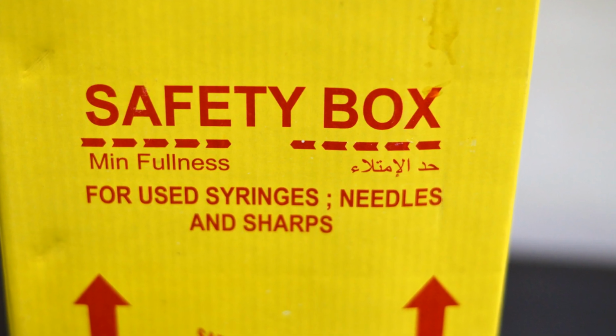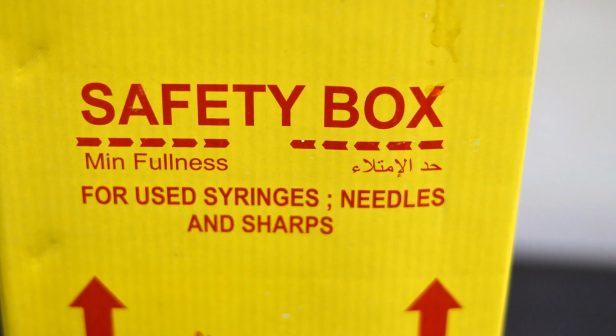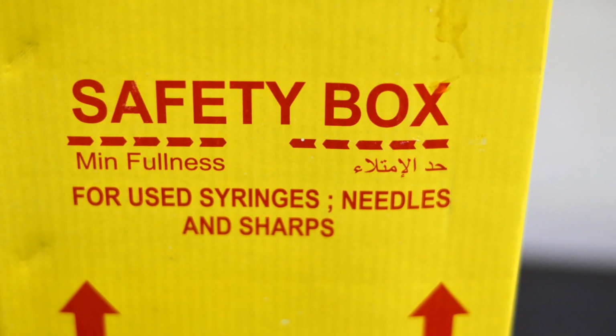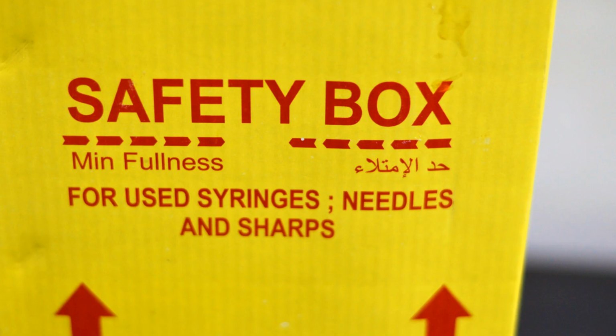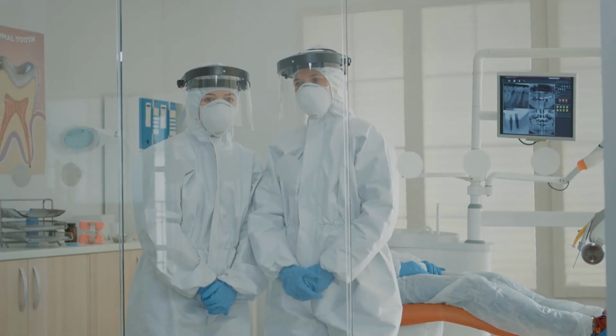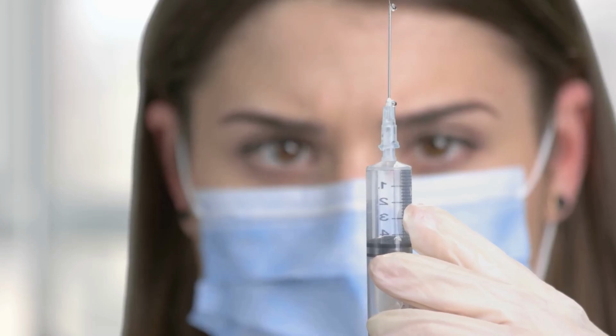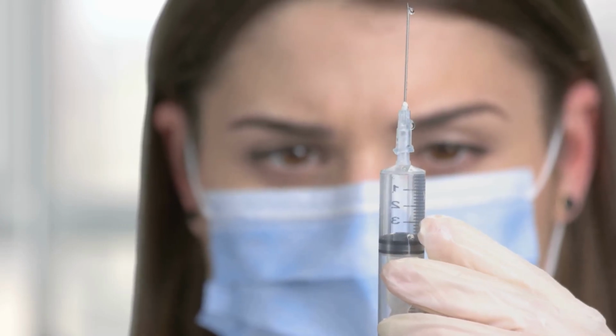Nobleman Care Services provides puncture-resistant sharps disposal containers, safety-engineered needles, and one-time use lancets. These devices are designed to limit your exposure risk when used correctly. Sharps safety rules include: never recap needles under any circumstances. Never bend, break, or remove needles by hand.